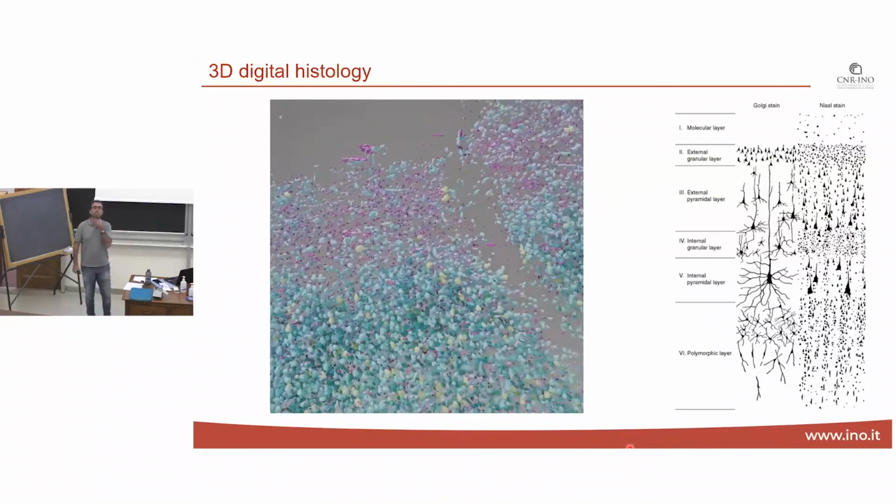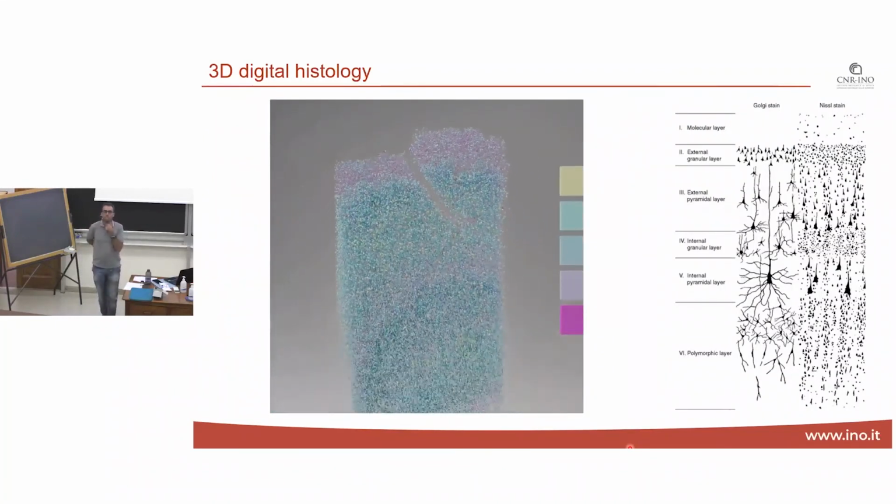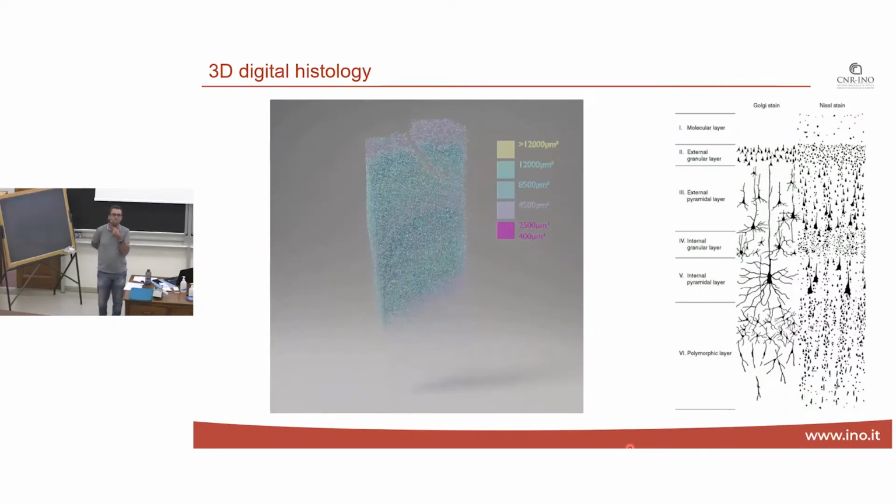And since it's not super high, I mean, compared to the standards of machine learning, it's not super high, but I know it might be 80% or something like that, or 85, it depends. But still, considering the size of this data, it's still something to work on. And we can see these layers. For example, since some of these subjects had some pathologies, apparently some of these pathologies alter the way that neurons are distributed along the layers of the cortex, and so we can study this kind of thing more quantitatively.